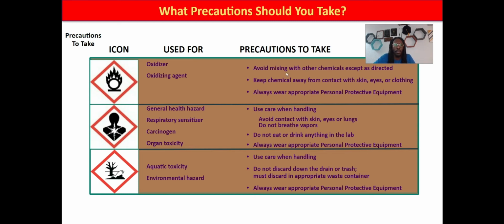And then be careful, right? If you've got an oxidizing agent, you've got to be careful about what you're mixing with. So hopefully the instructor that you're with, or me in this case, is making sure that that's all going simply as planned.